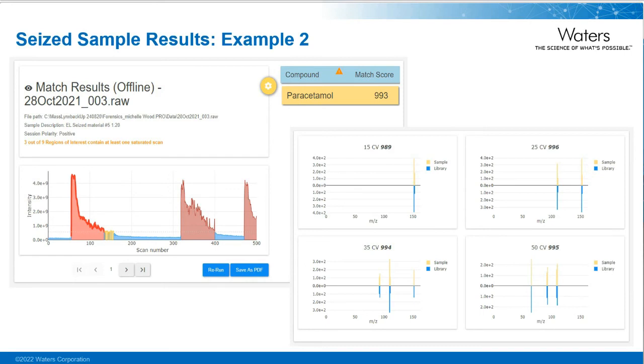Another thing to remember when using the RADIAN-ASAP is that the data in the top left are not chromatographic peaks, but a visual representation of the response. Therefore, they may not look as smooth as the peaks you get if you are used to using a chromatographic method.